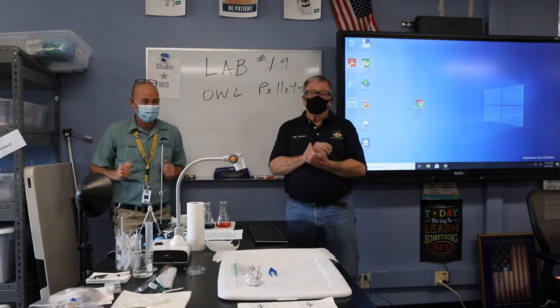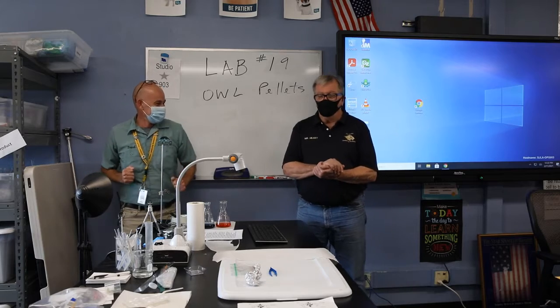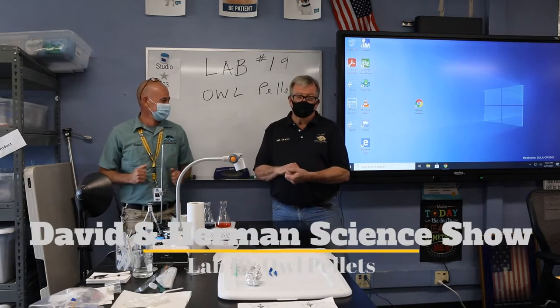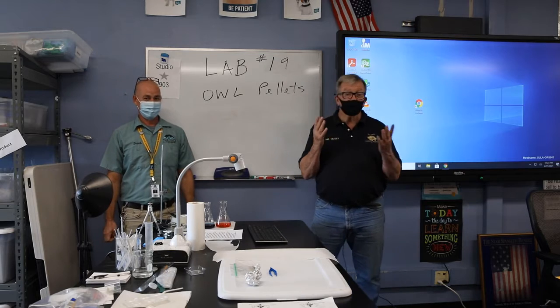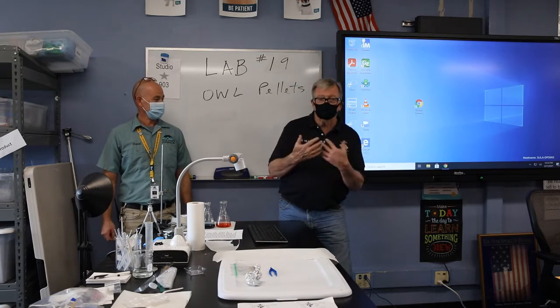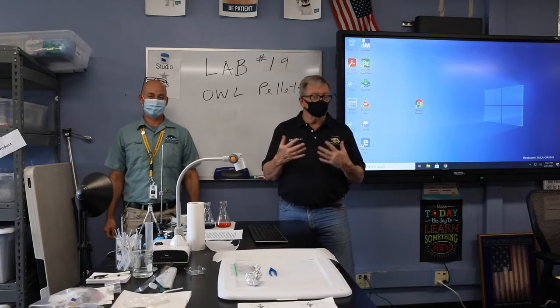All right, killer. Welcome to the ever famous David and Herman 7th grade science show. Today is a very special time you've all been looking forward to. We're going to dissect the owl pellet. You have a diagram. If what you discover in the pellet doesn't match the diagram, go online, find a different diagram. It could be any one of different size birds, different kinds of birds, different kinds of rats, moles, anything. All right?